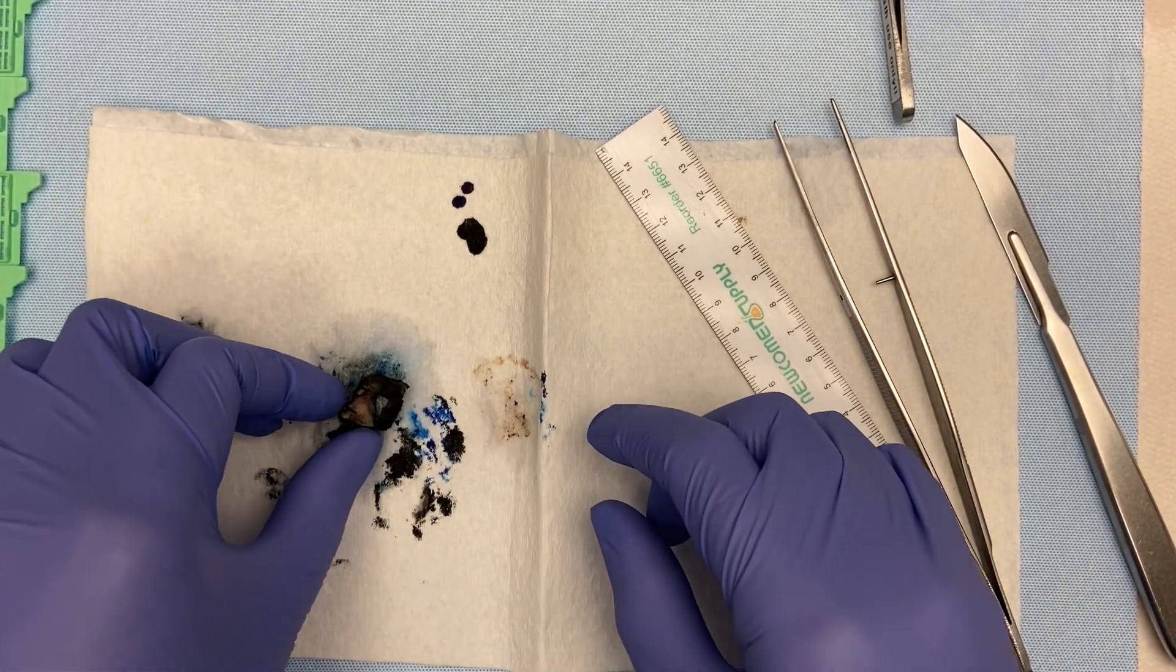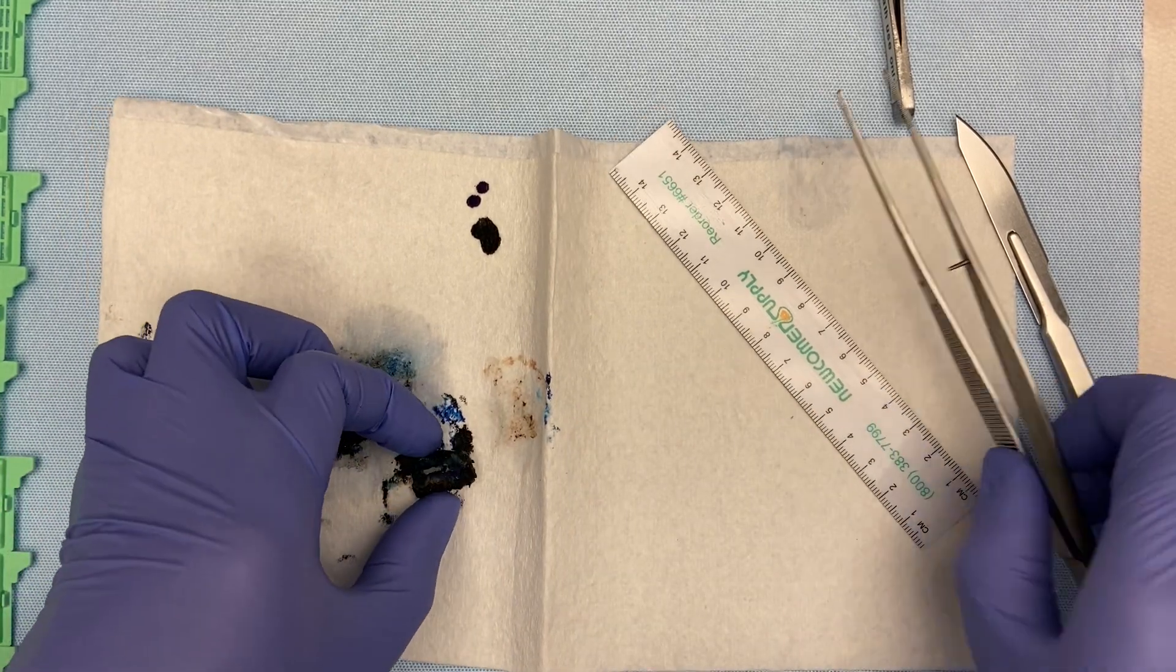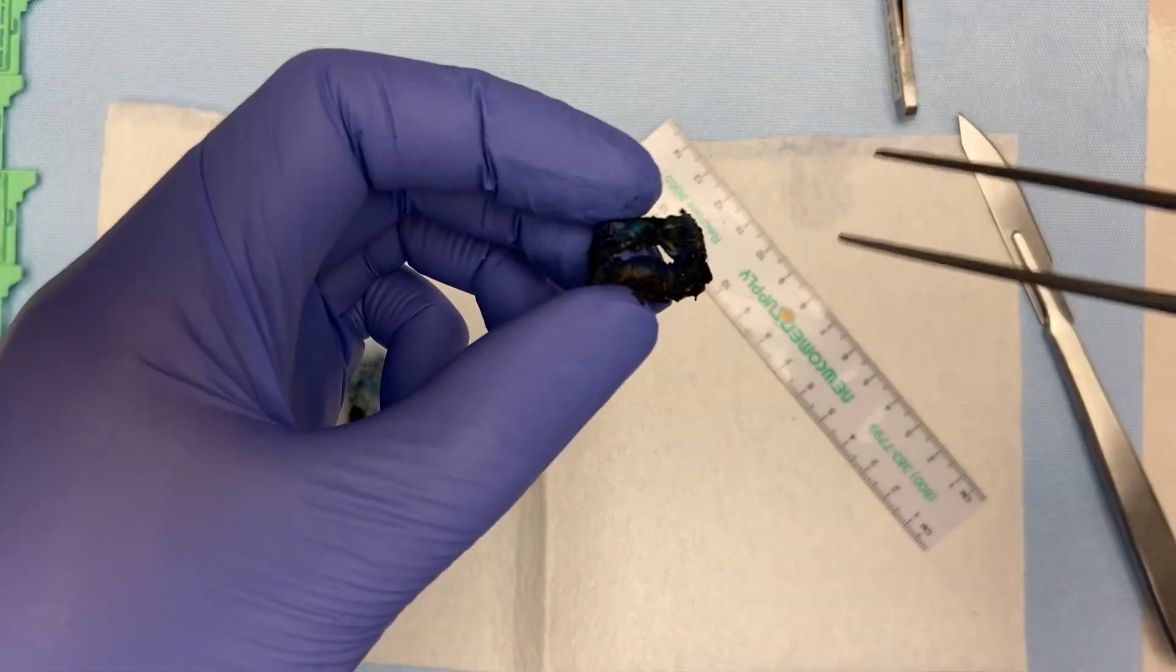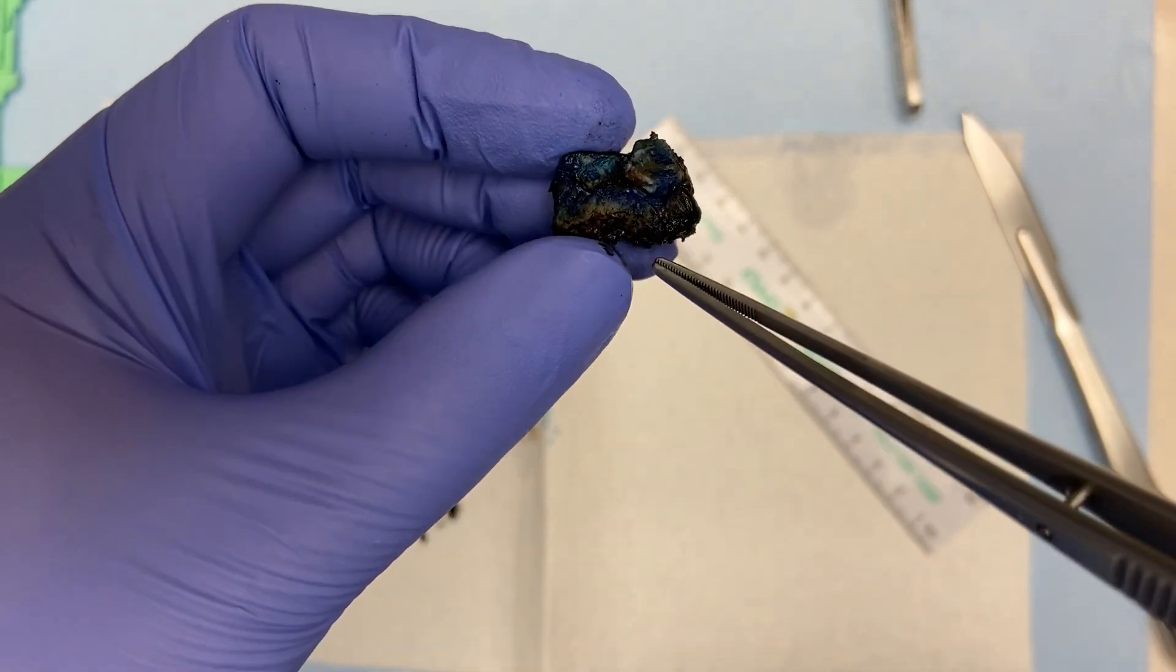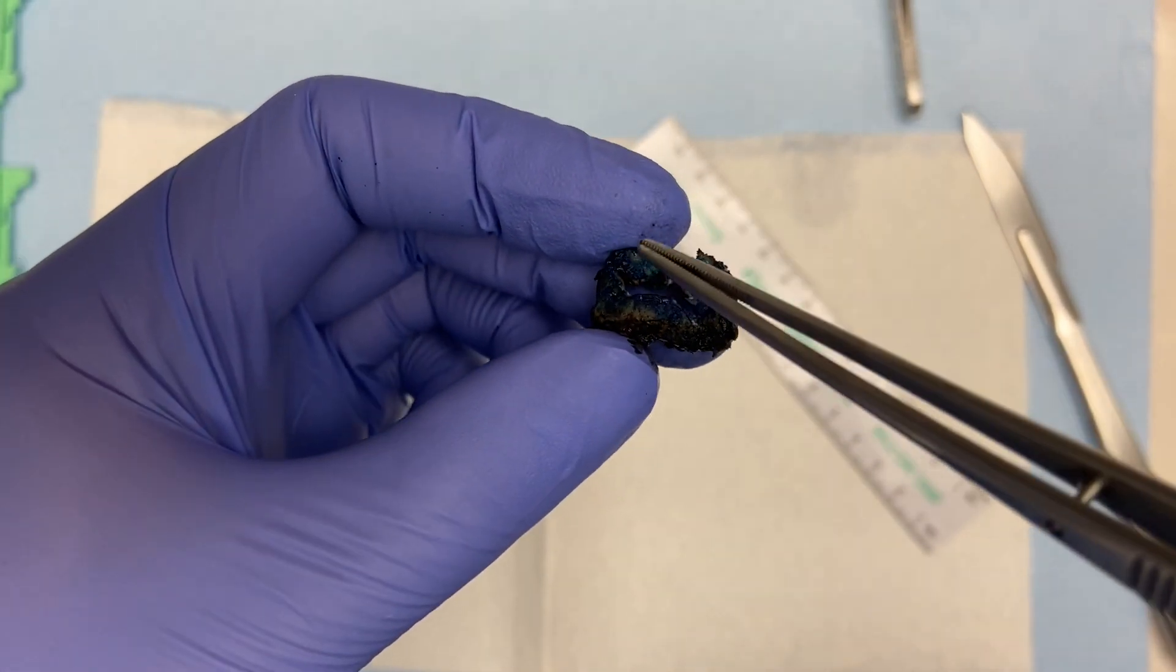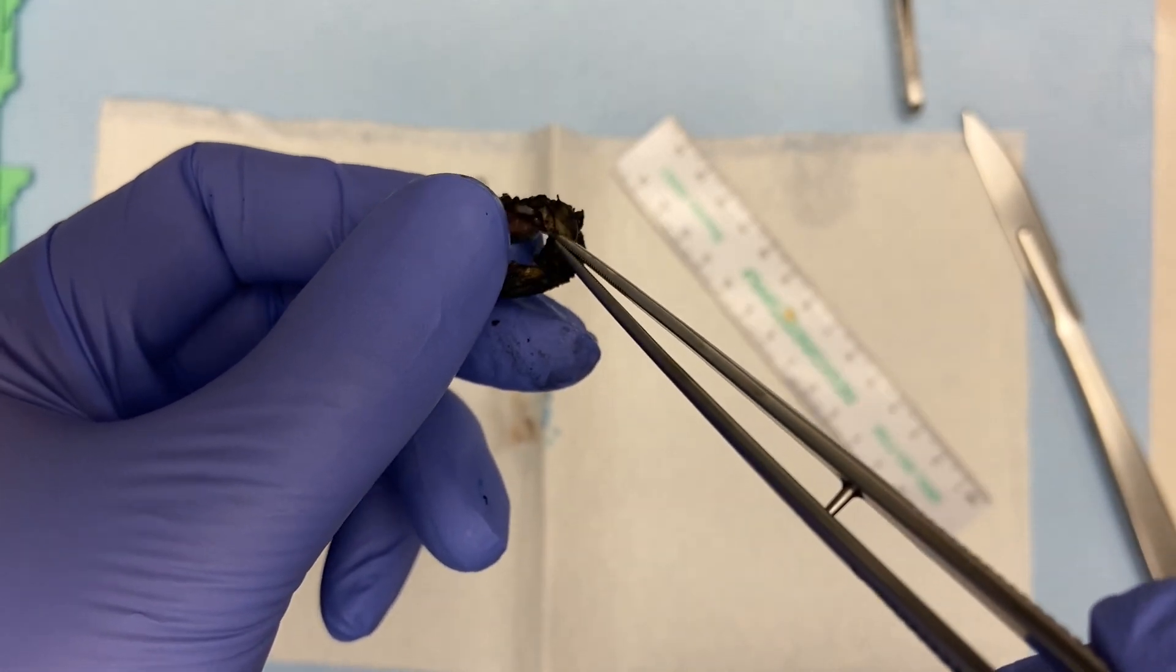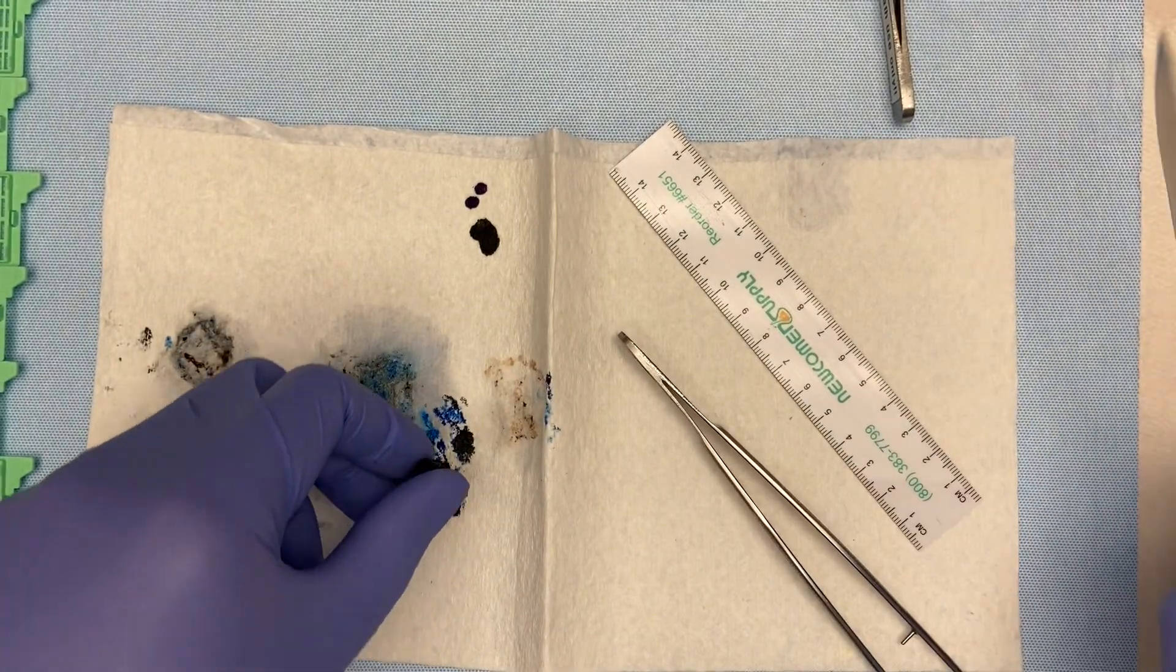So, we've inked the inner endocervical margin blue. We've inked the outer ectocervical margin black. And there's our mucosa in there. And now, I'm going to section it.